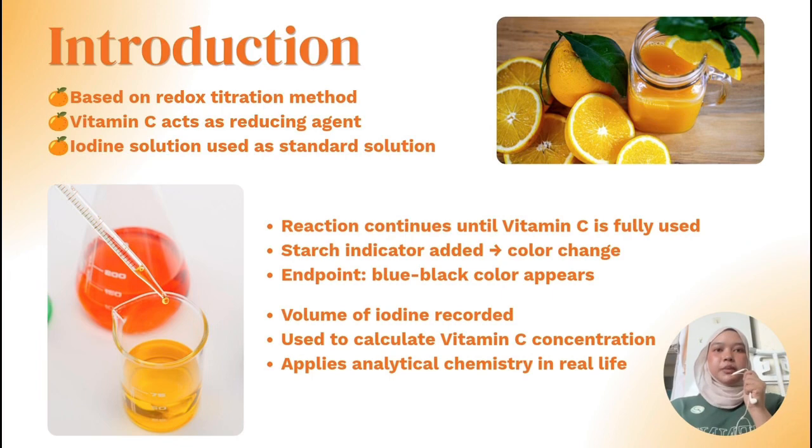This experiment is significant because it helps us understand how analytical chemistry techniques are used in real life, especially in food science and quality control. In addition, it also improves our skills in handling laboratory apparatus such as burettes, pipettes, and conical flasks, as well as performing accurate measurement and calculations.